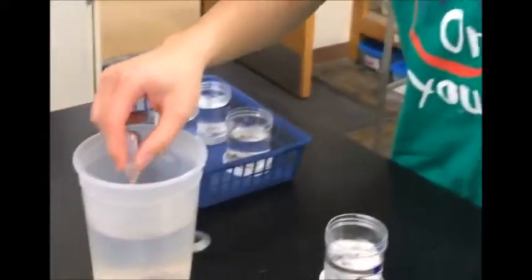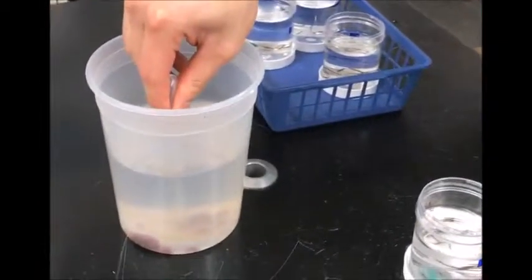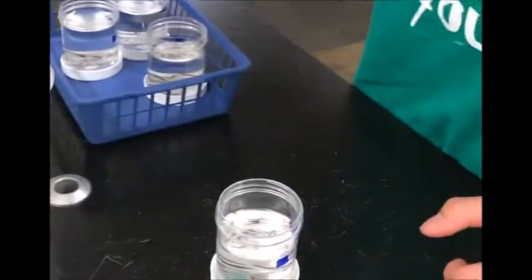When you're placing the Lumbriculus inside the Planaria culture, you want to make sure that there are enough worms for each Planaria. Simply place them down at the bottom and the Planaria will go towards the worms themselves.